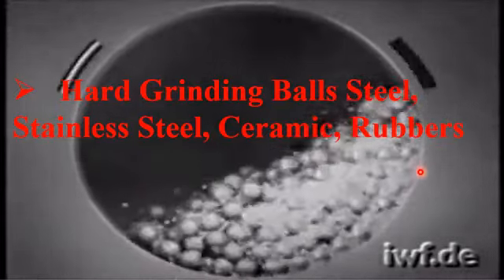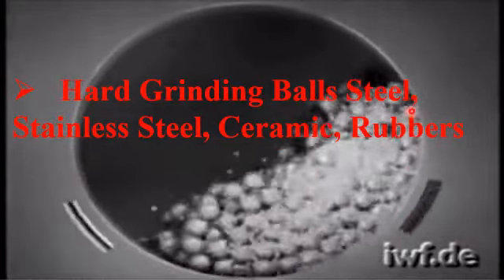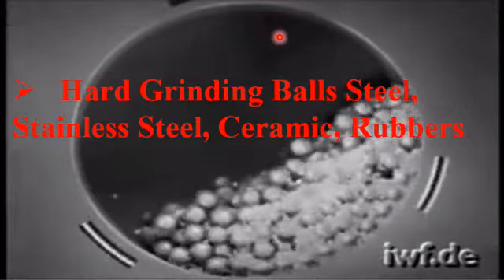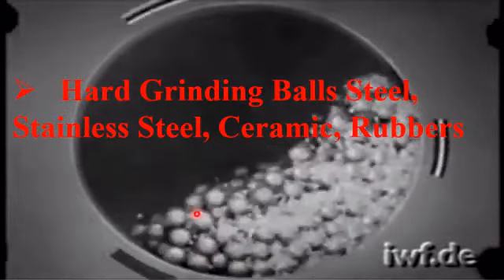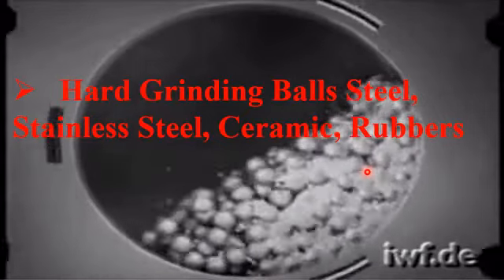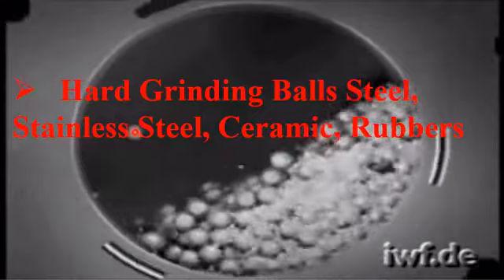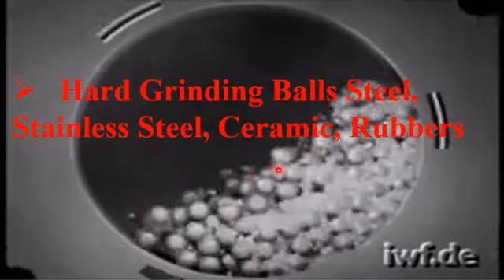So in simple words, a ball milling instrument consists of a rotating hollow drum partially filled with a grinding medium or grinding balls. The grinding balls are usually steel, stainless steel, ceramics or rubber.